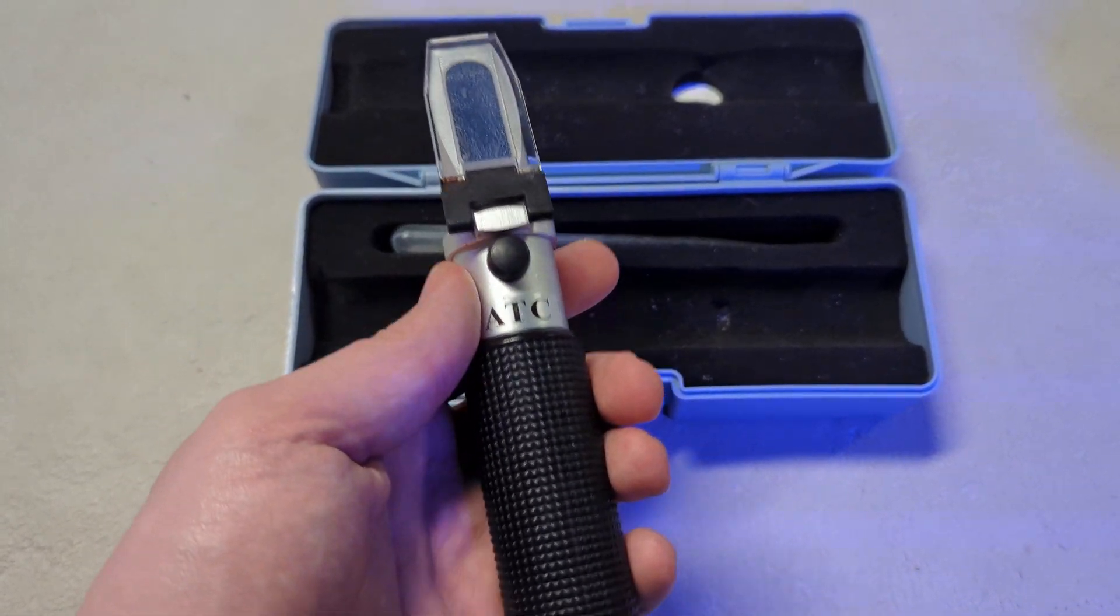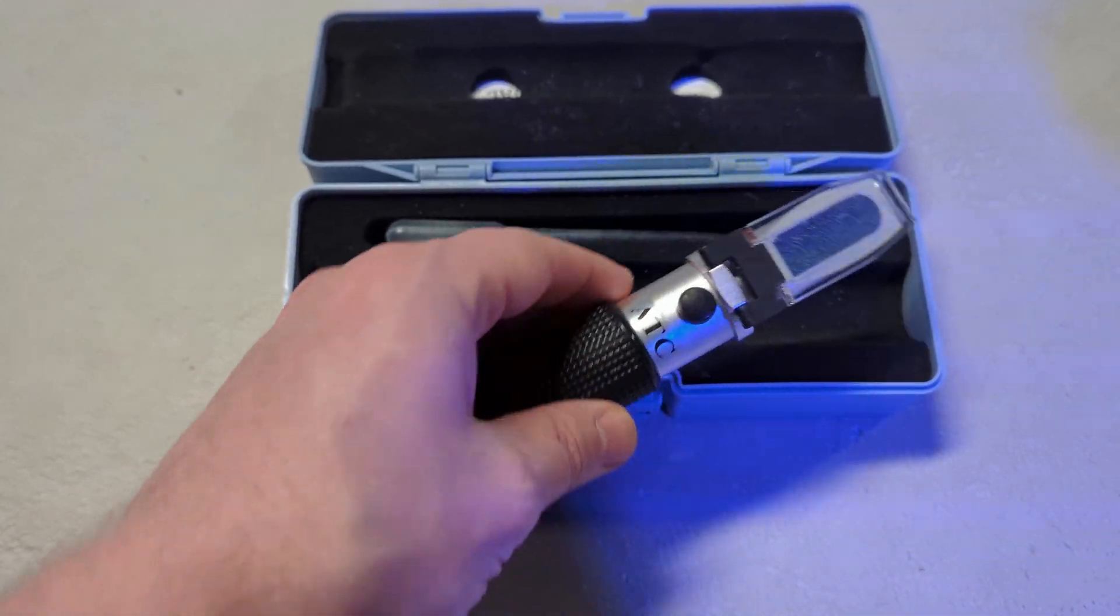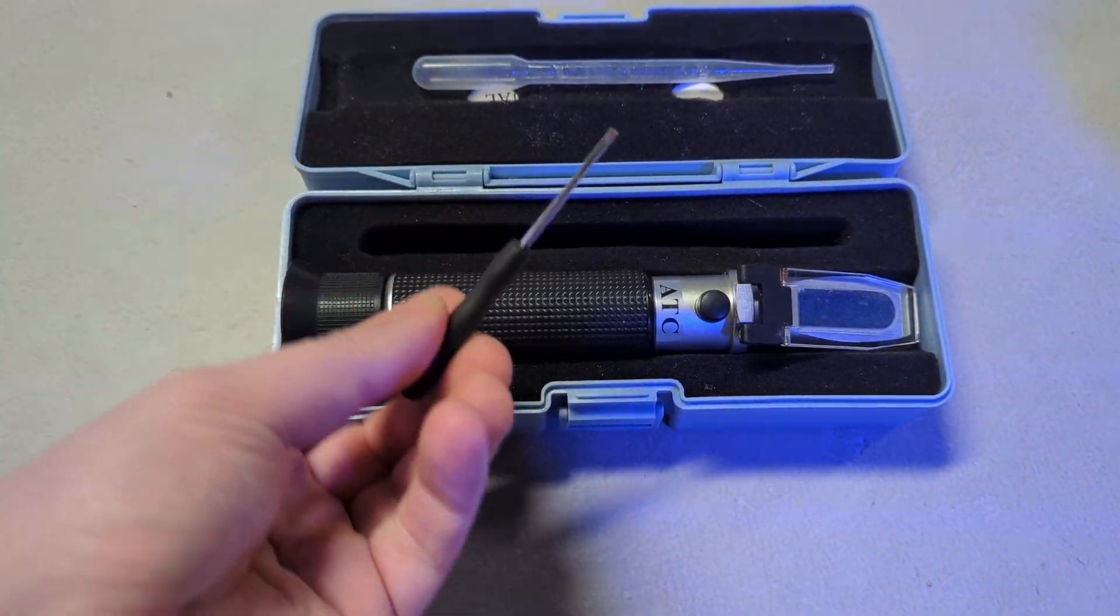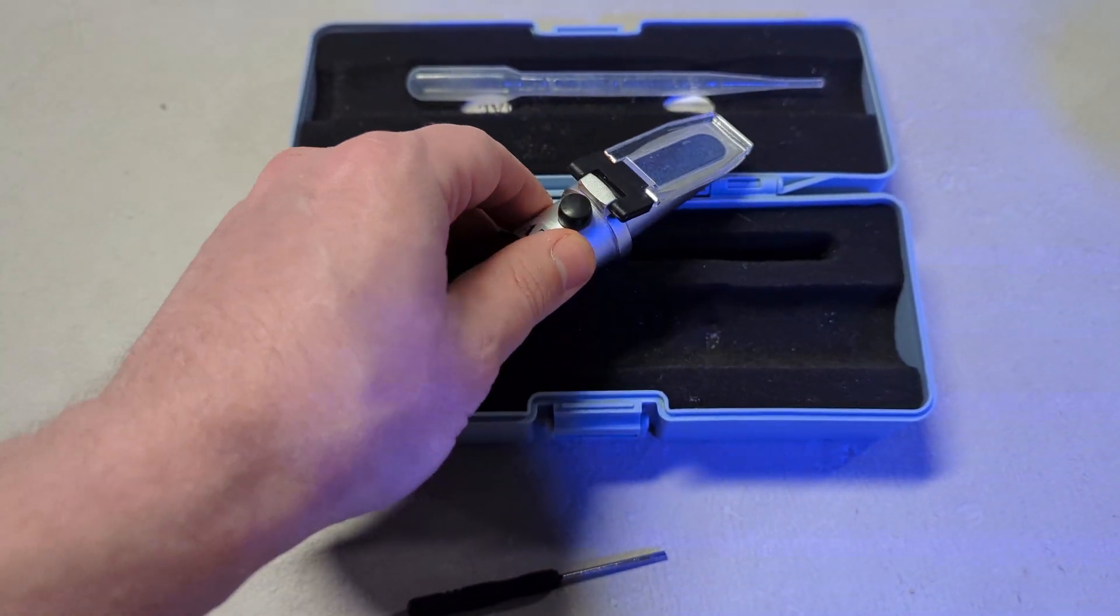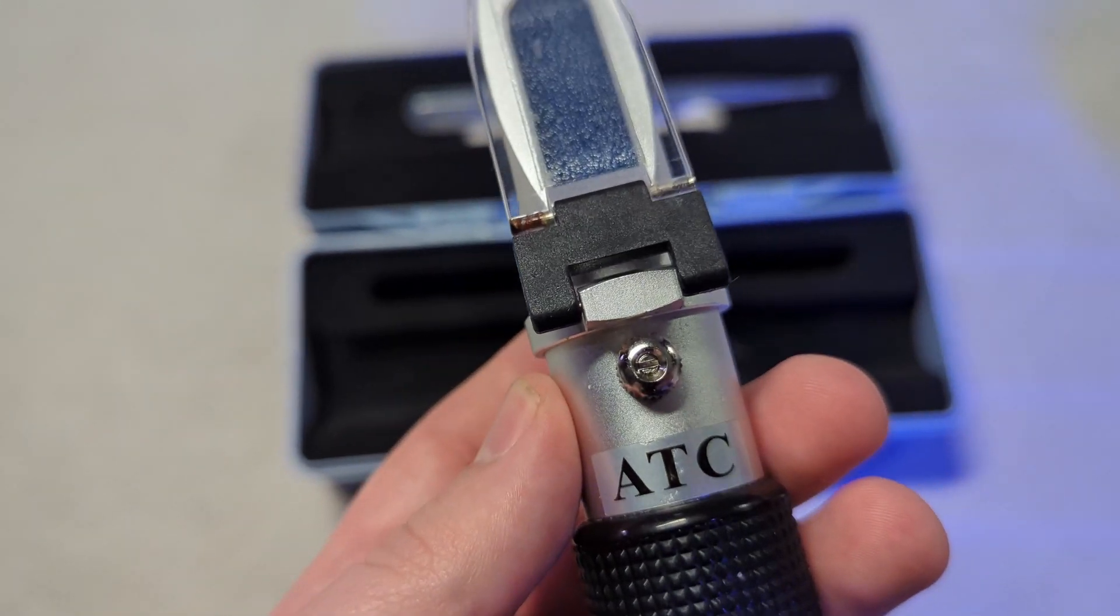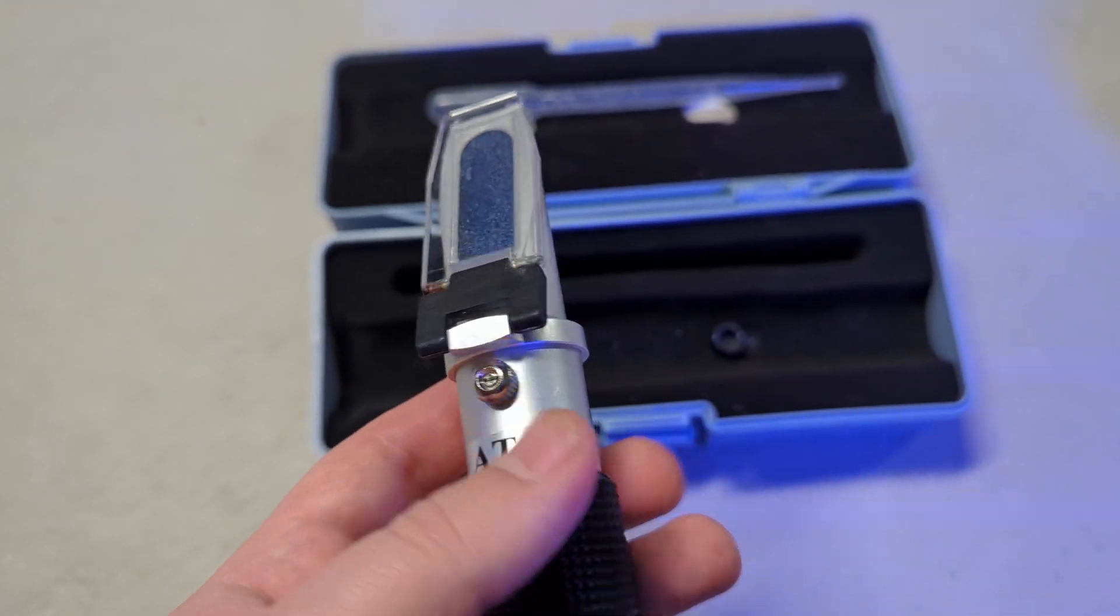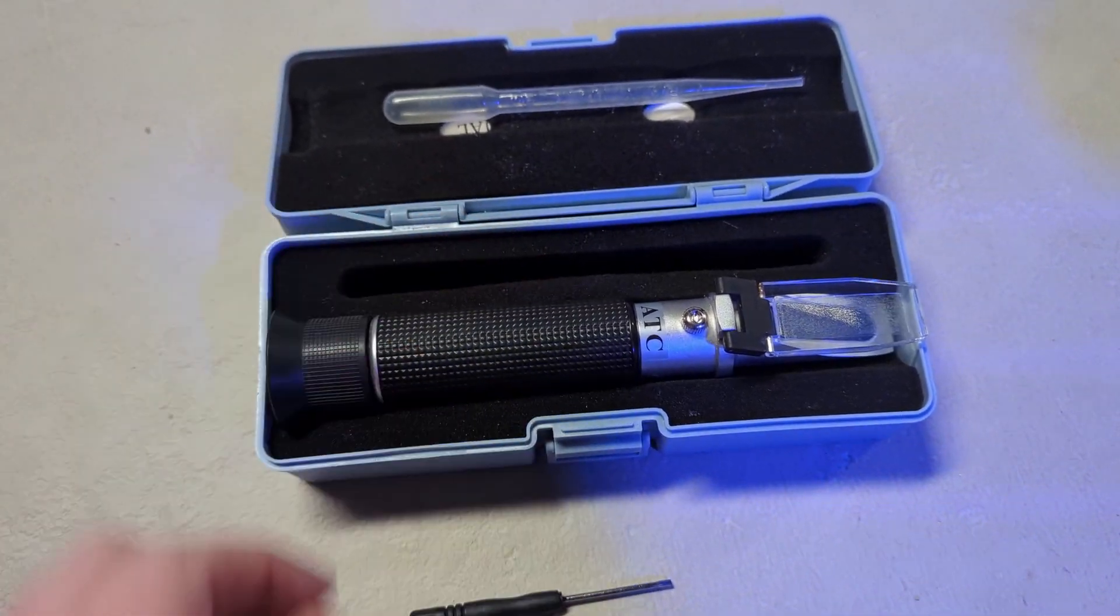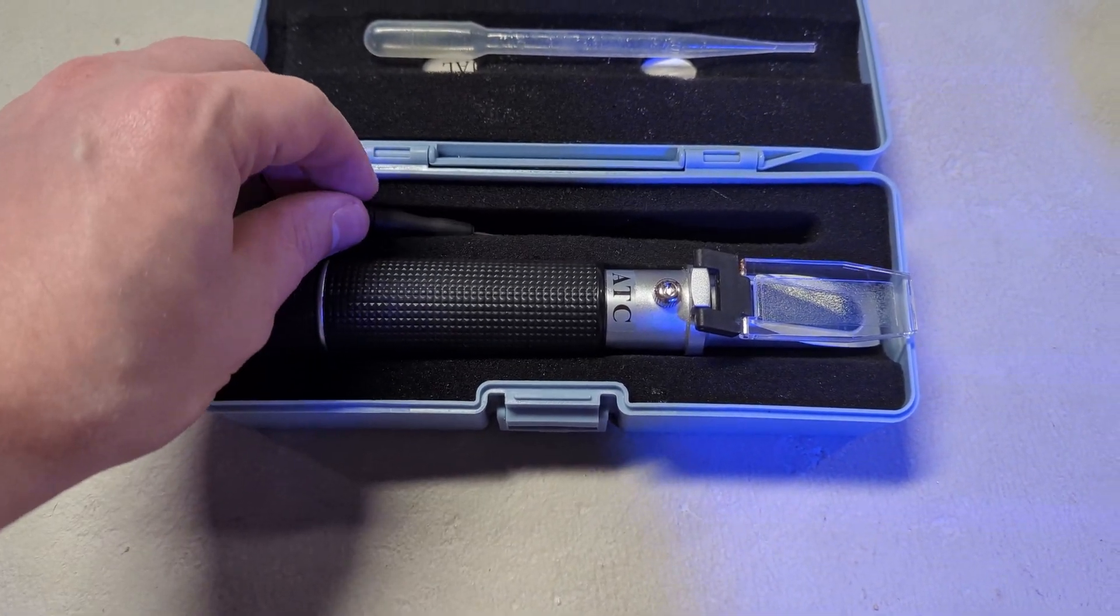You'll want to properly calibrate the refractometer before using it. I recommend using a calibration solution to guarantee you get appropriate readings. To calibrate it, take the little screwdriver out of the box, pop off this rubber piece, place the solution on the eyepiece, look through the lens, and tighten or loosen the screw depending on what salinity level the solution recommends you test for. If anybody is interested in a more in-depth video about that, let me know and I'll be happy to share one.